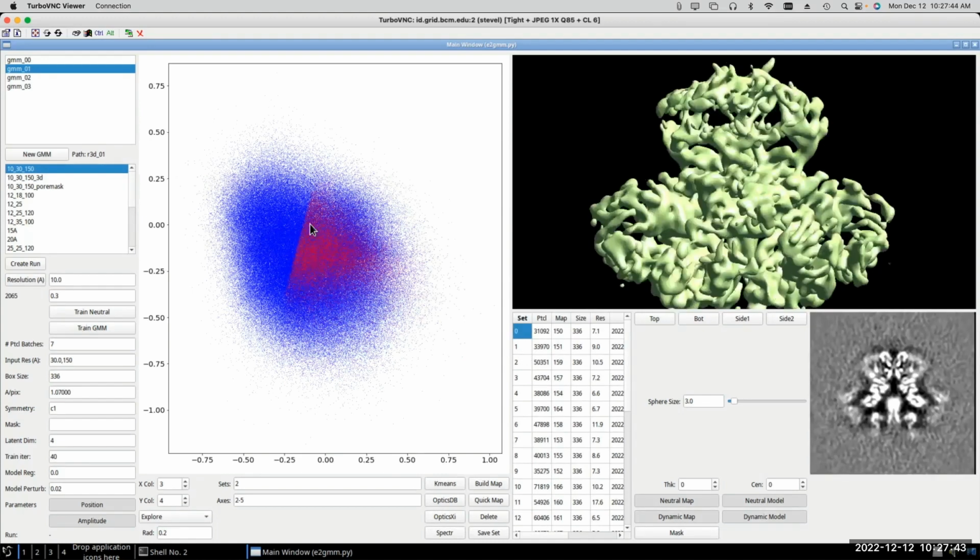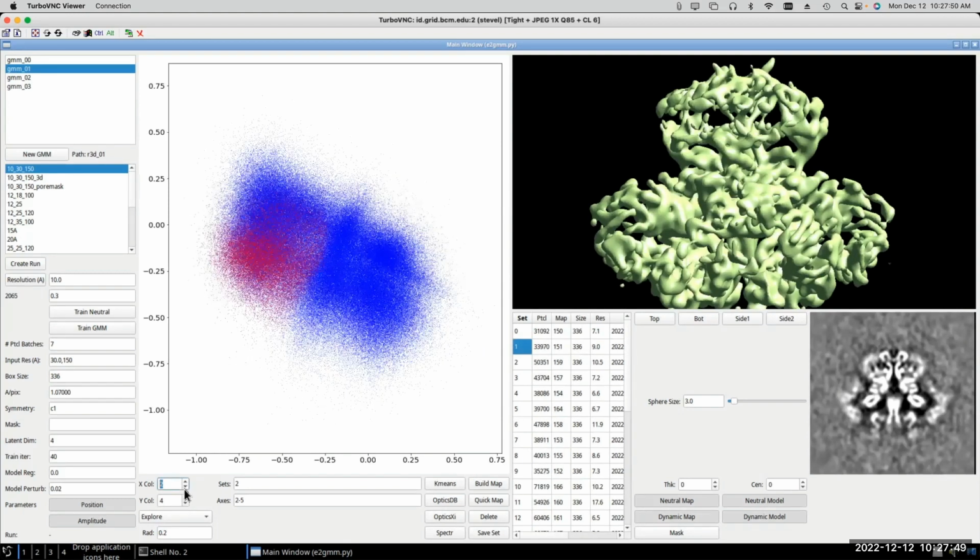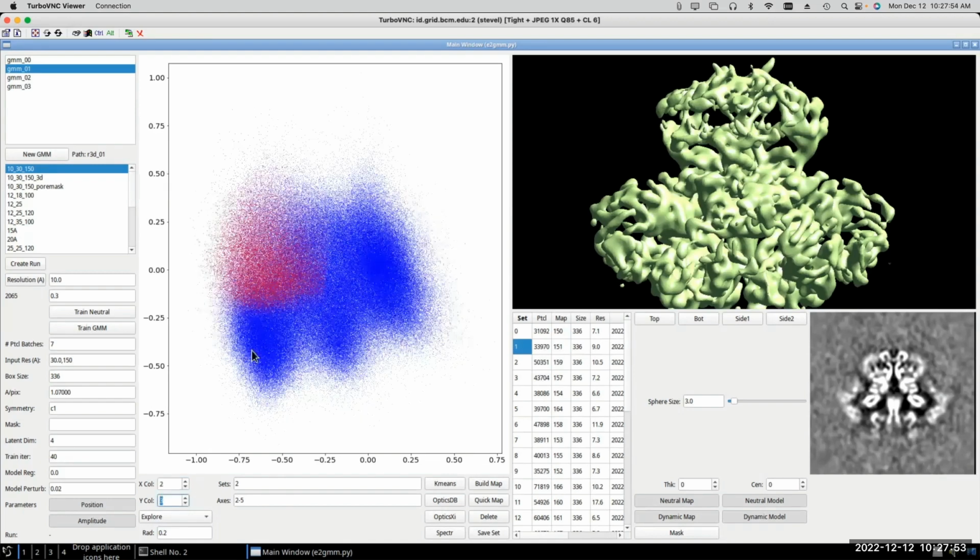Right, so you can pick a cluster like this, and it looks like it's just randomly spread out across space. But if we pick different axes to look at it in, you can find out that it's actually better confined than it seems. So in the four-dimensional space, it's actually a cluster, but in these two-dimensional projections, it looks like it's overlapping with lots of other stuff in any particular orientation that you're looking at.